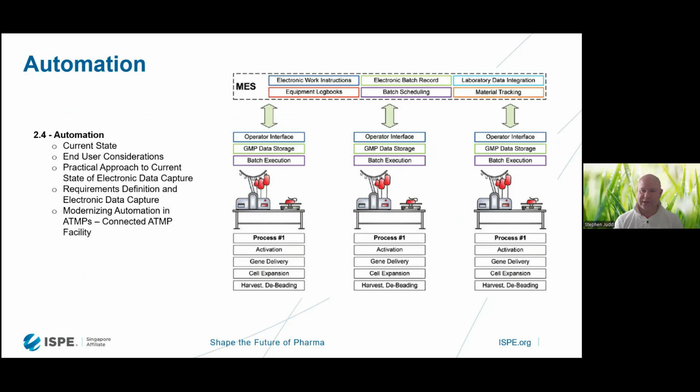Just want to look at the automation section now then. As I mentioned, the initial therapies were very manual, with individual unit operations requiring manual transfer between the different unit operations, and having 2 operators per station to ensure that everything was done and checked properly, because this is what is required through good aseptic technique.